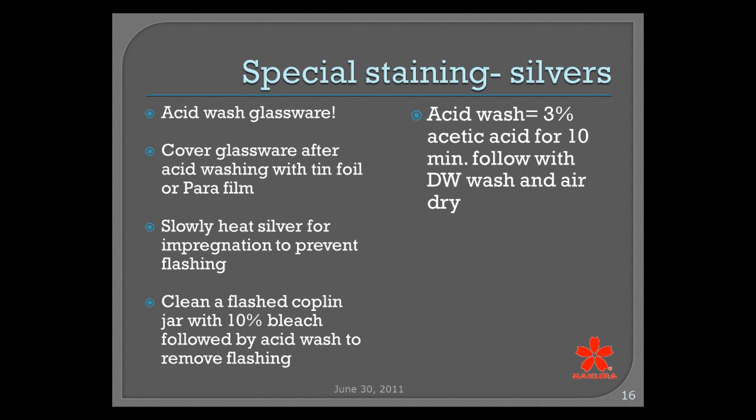It will prevent dust particles, again, from getting in the glassware that you just acid washed to remove that stuff. And two, it alerts the person behind you that this particular glassware has been acid washed. In my lab, I have two sets of glassware: a cabinet for those that have been acid washed, and a cabinet for those that have not been acid washed.